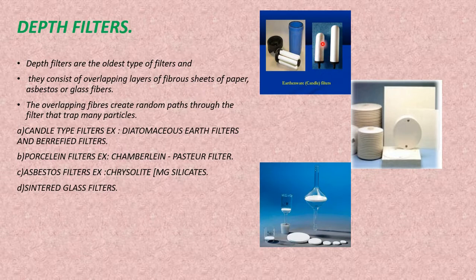So this is going to have a hollow candle open at one end, cemented with a metal nozzle. Here you can observe the liquid to be filtered is either poured into the candle or passed through the candle. So that's how this is going to work.